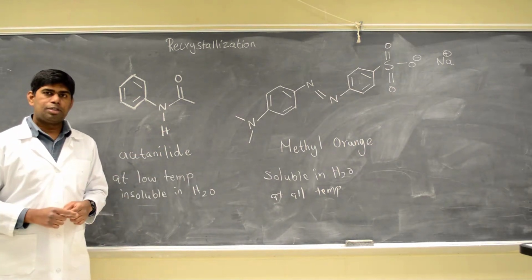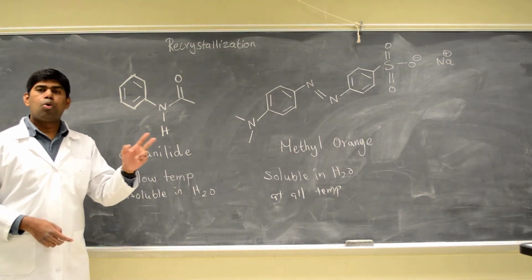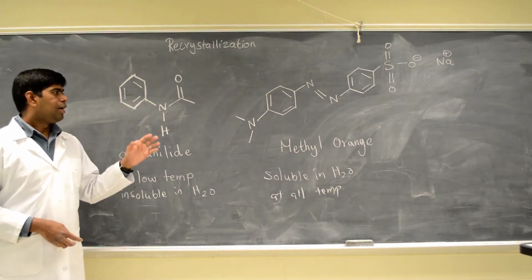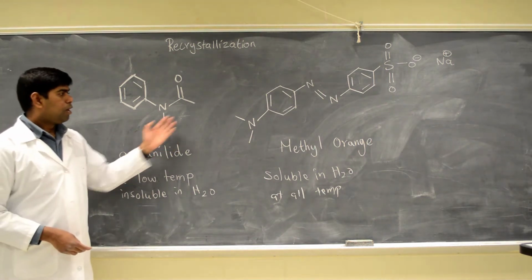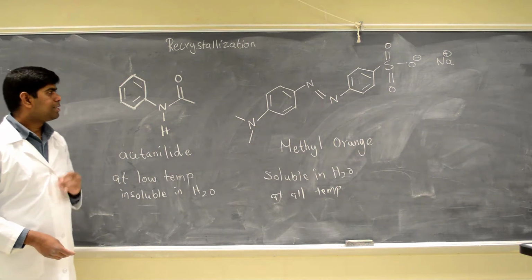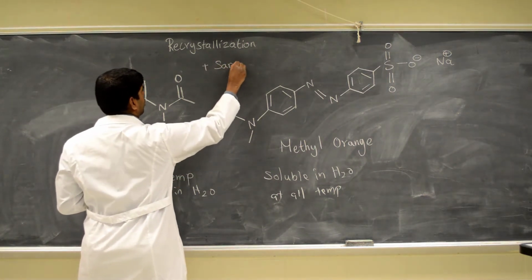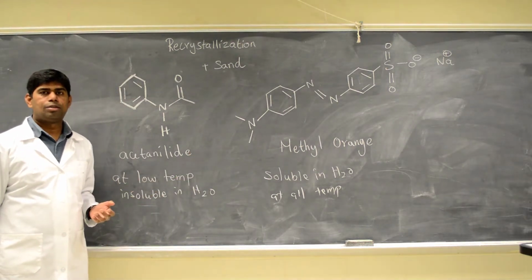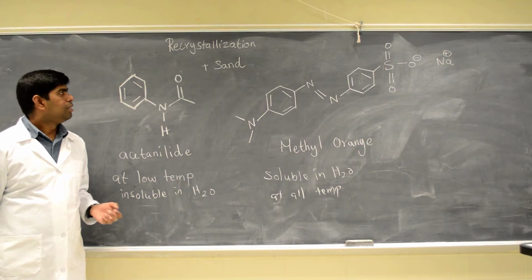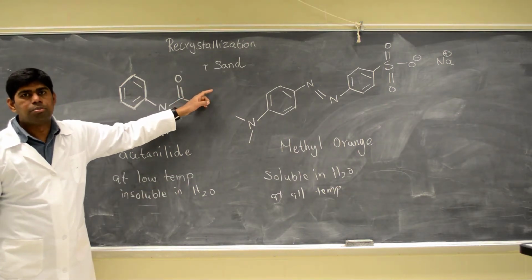To add complexity, I'm going to add maybe two more substances into this mixture. The third one is sand. I'm going to add sand to this mixture. What do we know about sand? Solubility of sand in water: sand is insoluble in water at all temperatures.